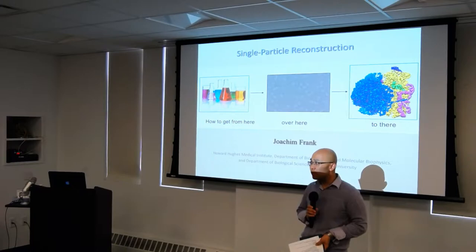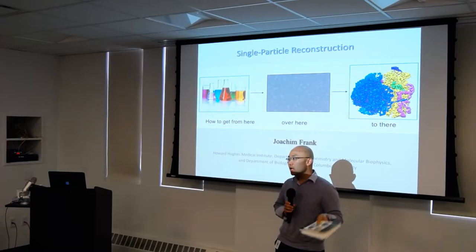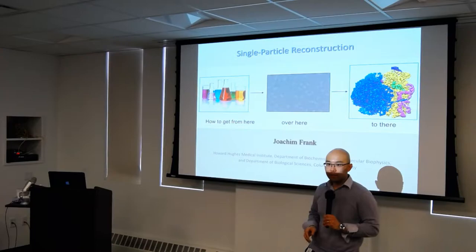I would have to say that we don't have too many textbooks for the course, but if you're in the field of single particle analysis, this is one book that you probably should get and read through. A lot of early single particle reconstruction algorithms and mathematics have been worked out by Joachim. Actually, the first program used for single particle analysis was SPIDER, which he championed when he was at the Wadsworth Institute in Albany. And I think he was an early adopter of a lot of these maximum likelihood algorithms, especially the Bayesian statistics, and moving on to now interesting things with manifolds. Okay, without further ado, Joachim Frank.